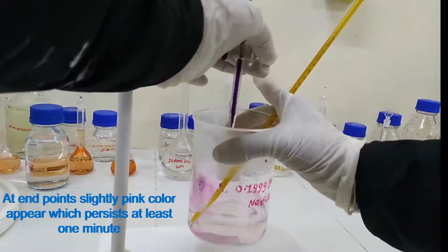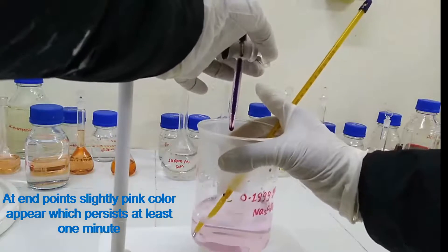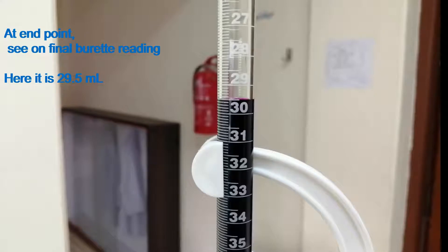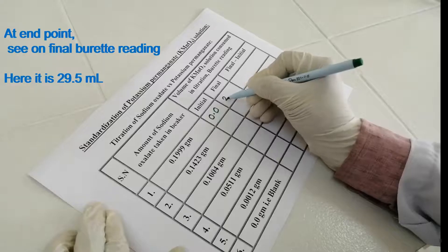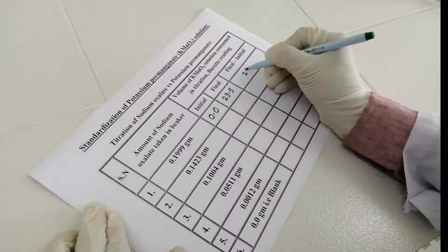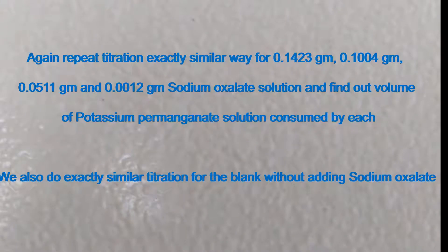At the end point, a slightly pink color appears which persists for at least 1 minute. See the final burette reading — here it is 29.5 ml. So 0.1999 g sodium oxalate solution consumes 29.5 ml potassium permanganate solution. Repeat the titration in exactly the same way for 0.1423 g, 0.1004 g, 0.0511 g, and 0.0012 g sodium oxalate solutions, and find out the volume of potassium permanganate solution consumed by each.